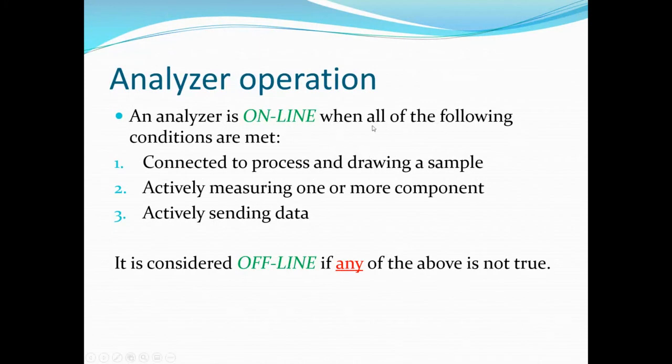An analyzer is online when all of the following considerations are met: connected, drawing sample, measuring one or more components, and sending data. If any one of these is not true, we are not online.